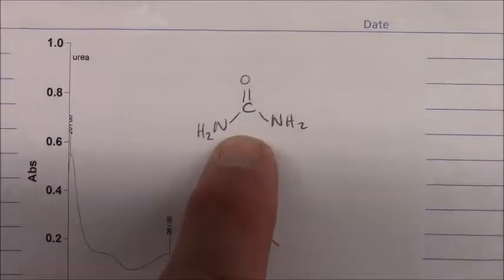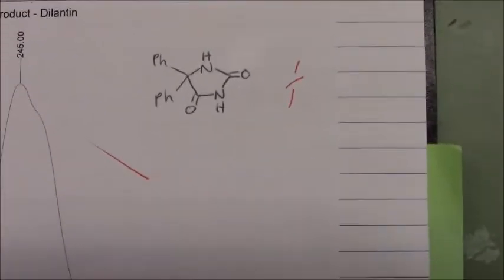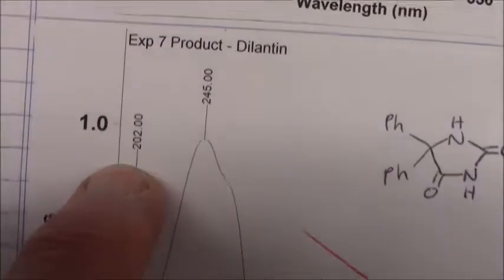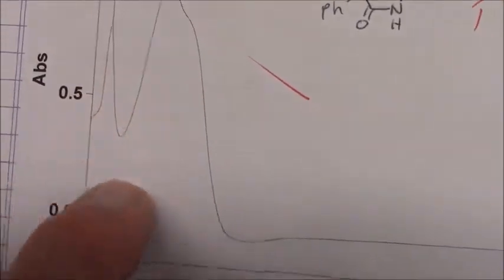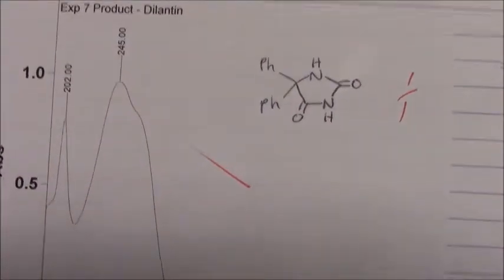Now moving to this, a previous year's, hence it's already marked. Urea looks like that, that's fine. But look at their Dilantin. I understand the 202 peak, which would trail down here, matches this one. So obviously there's some leftover other material giving a UV absorption right there.